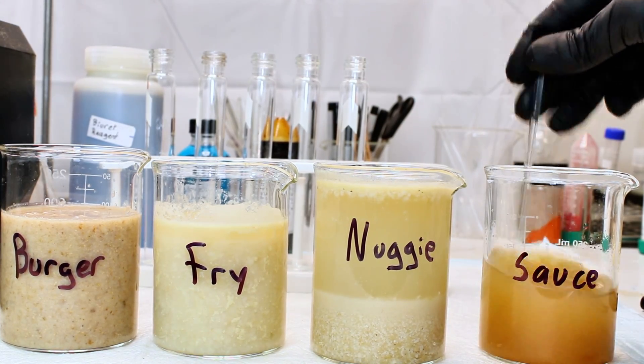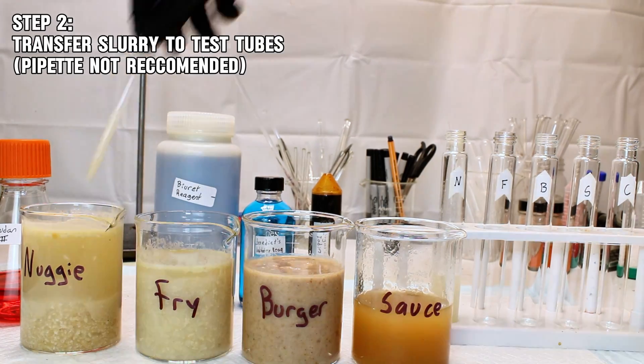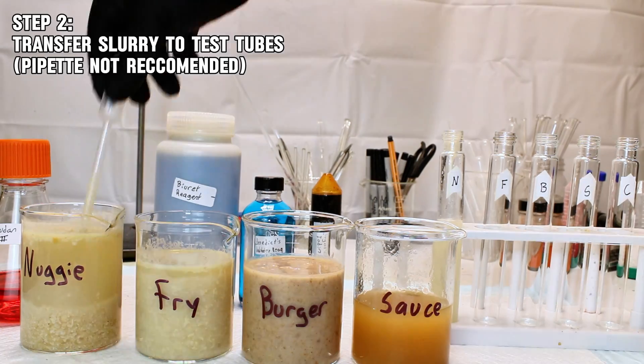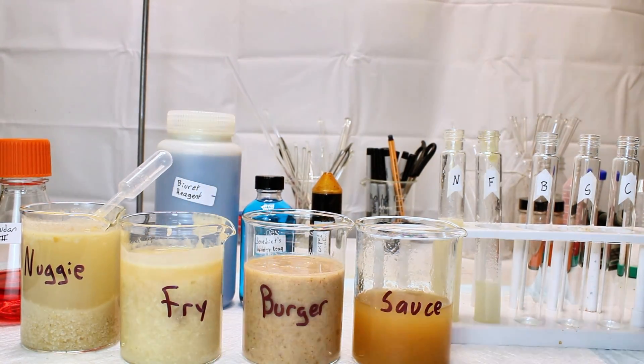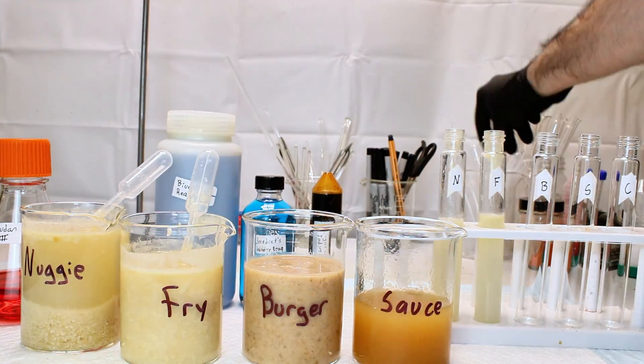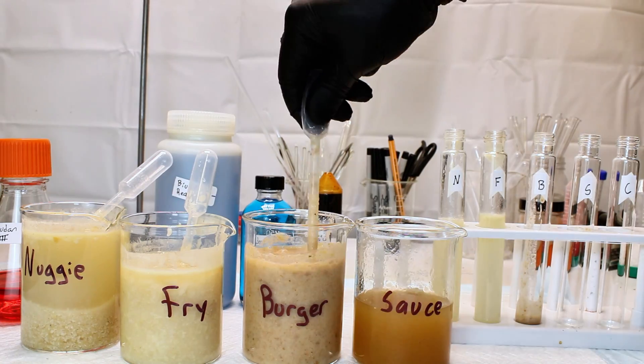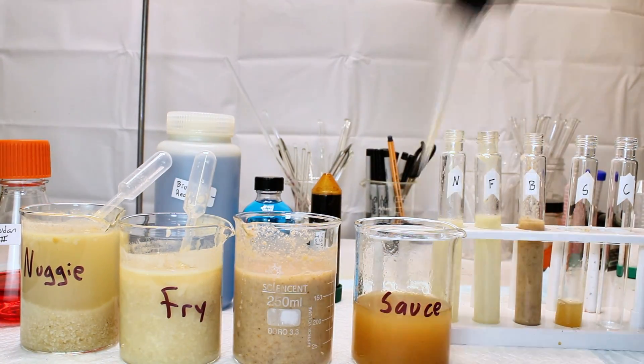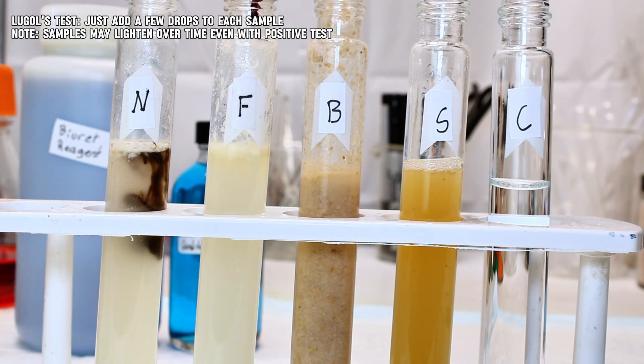To do this, I began by pipetting some of each sample into four respective test tubes. None of these food slurries were in any way really homogenous, and tended to clog the pipettes to the point that eventually, I just started pouring them into the test tubes. A fifth test tube was filled with distilled water to act as a control. Once this was done, I then simply added a few drops of Lugol's iodine to each solution and watched for a color change.